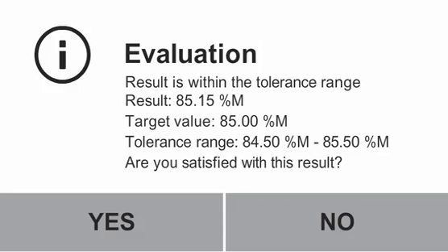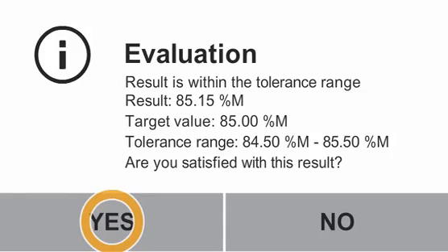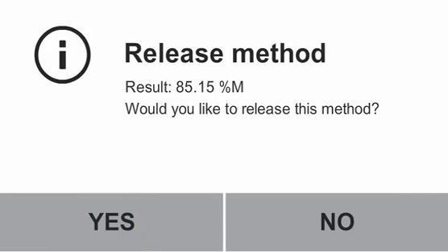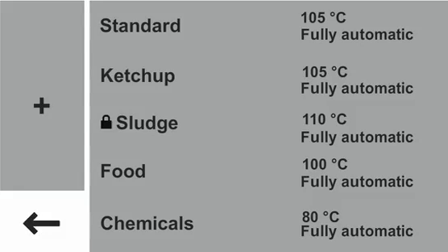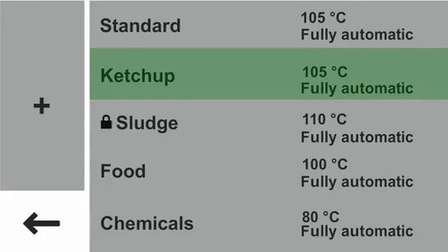After your test run, you will receive the question if you are satisfied with the result. In case you are not, you could continue with another test run to optimize the result. In our case, the result of 85.5% is in the area of tolerance and you can confirm with yes. Now you can release the method. Please confirm with yes and the method is released. The method ketchup has been successfully created, tested, and released. The method is now showing up in the overview of methods.